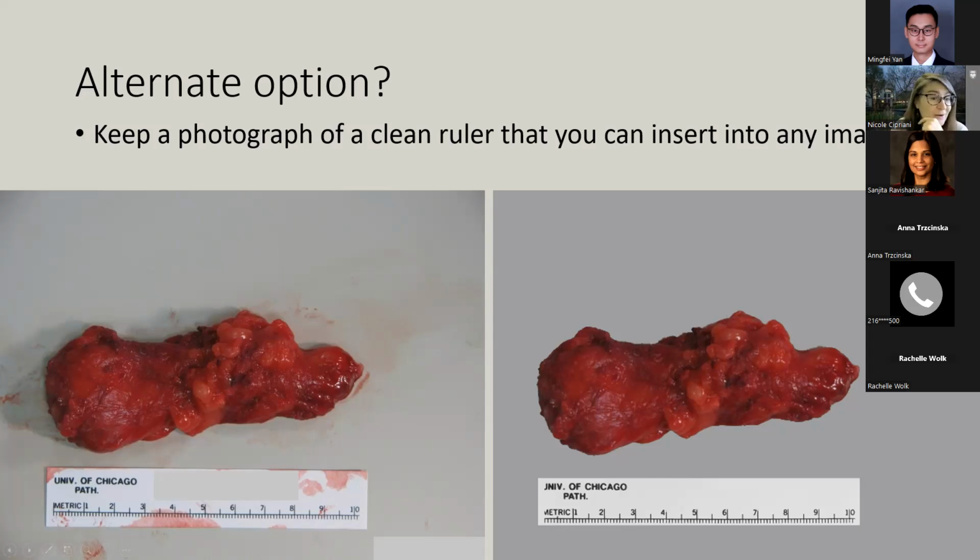Do you have, this is with shadows? Yeah, I have some examples later of shadows, and I feel like the shadows are less of an issue with the camera. It's not really the macro path versus the Canon, it's the lighting that you have. I'll show you what the shadows look like with the tungsten lights versus the light stand. But honestly, shadows have been an issue that we have had problems with, because we are on a flat surface.